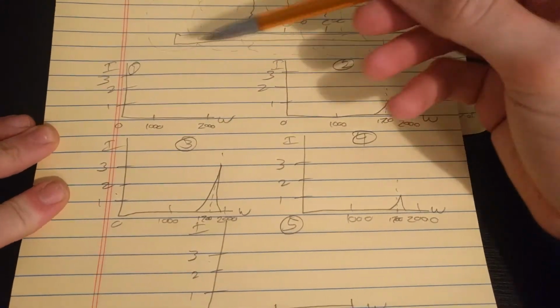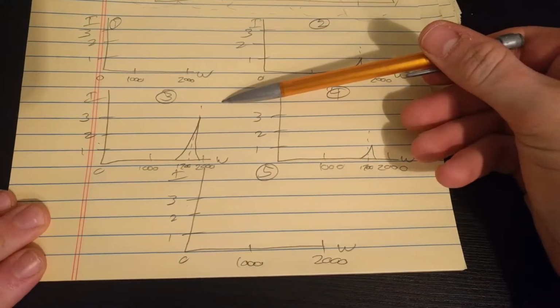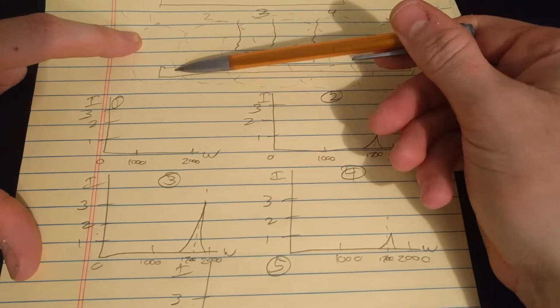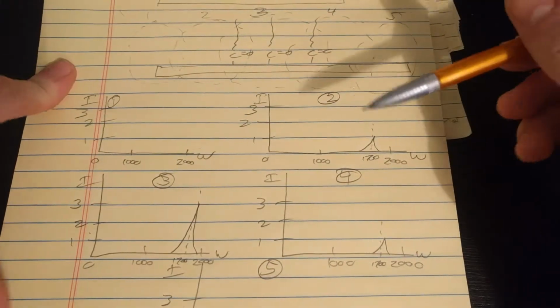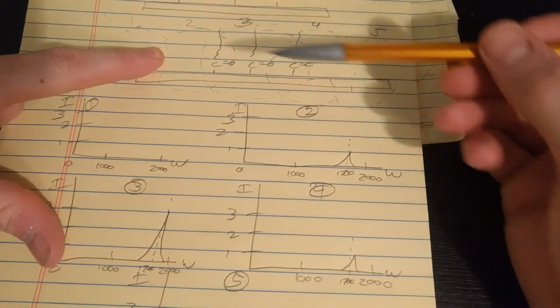Okay, so we took 5 different Raman spectra at 5 different points in space, and we got 5 different Raman spectra that look like this. Now in point 1, there's no molecules of our interest, so we see no signal where the carbonyl band shows up. The carbonyl band shows up around 1700. Now in 2, there's one molecule with the carbonyl bond.